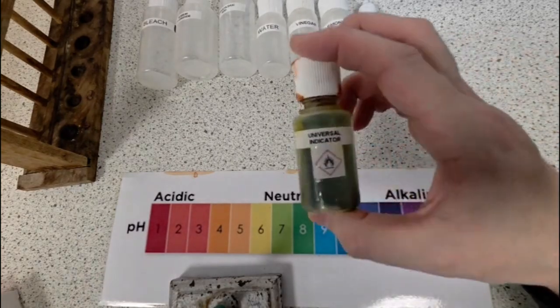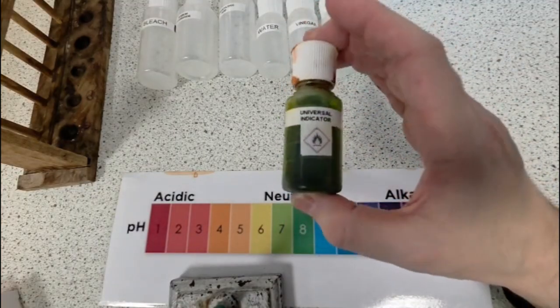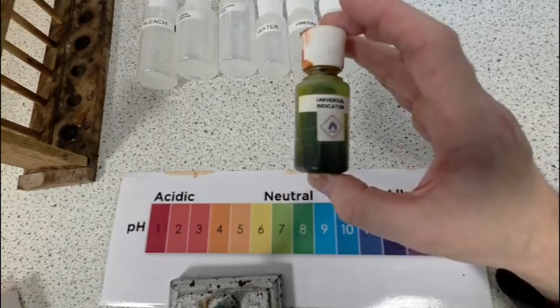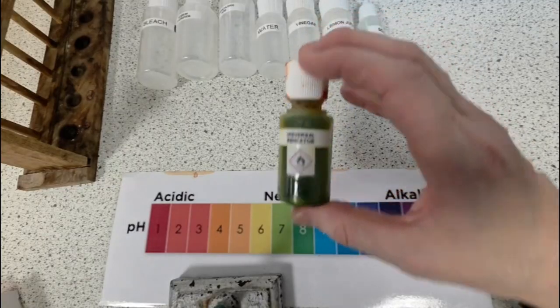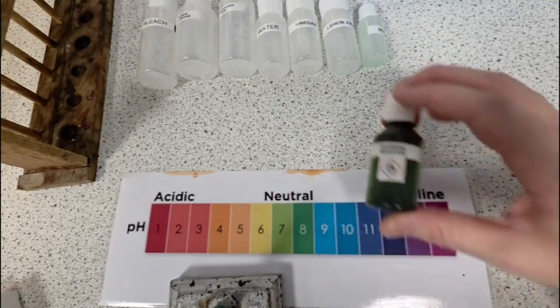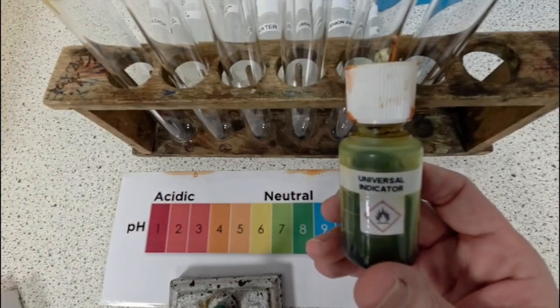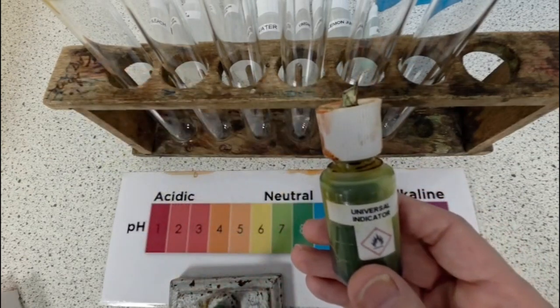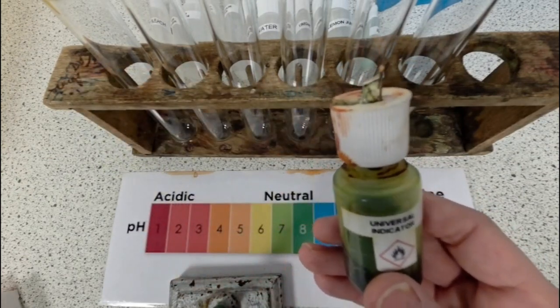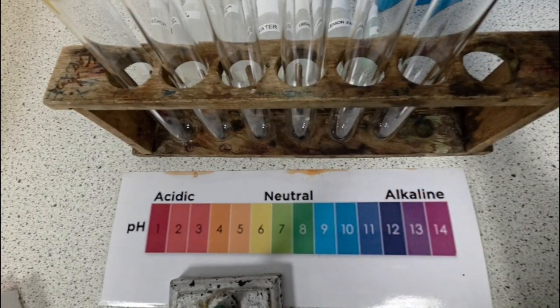Here is the universal indicator. As you can see, it is a green shade. Now it looks very dark at the moment, but that's because it's quite concentrated in this bottle. You usually only use a few drops of it, and that will give you this range of colors. So let's start and have a look at how this works. I'm just going to pop 3 drops of universal indicator into each of these boiling tubes, and then it will be used to identify the pH of the different household chemicals.